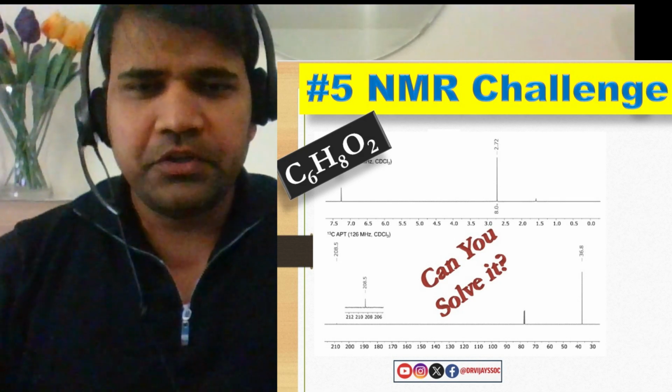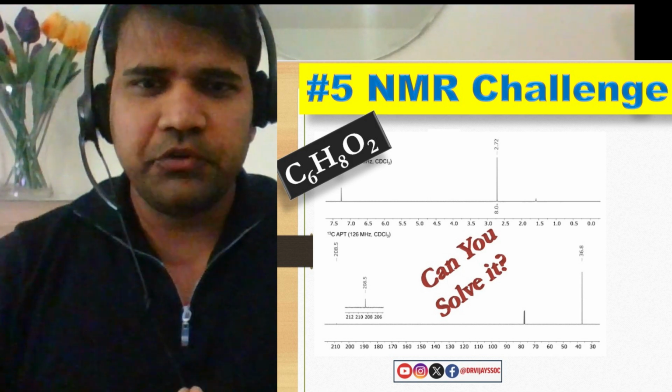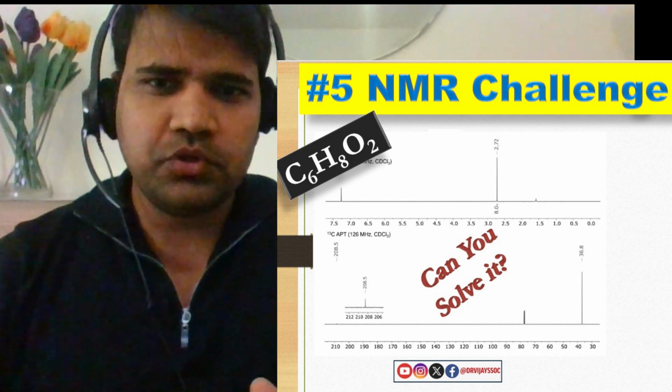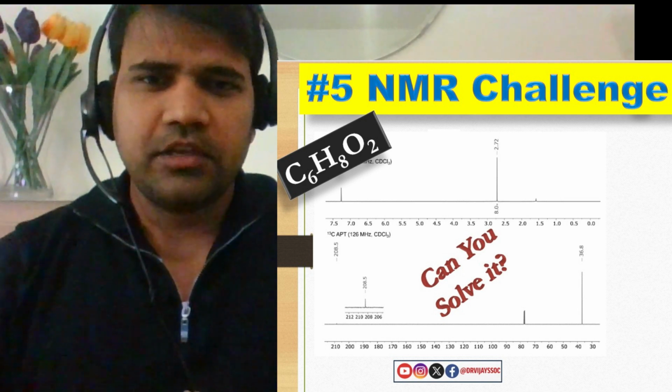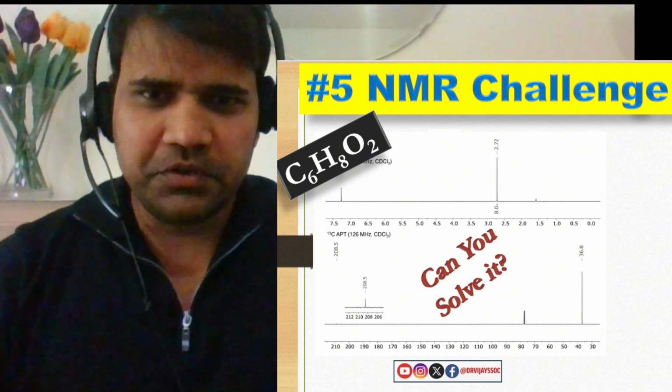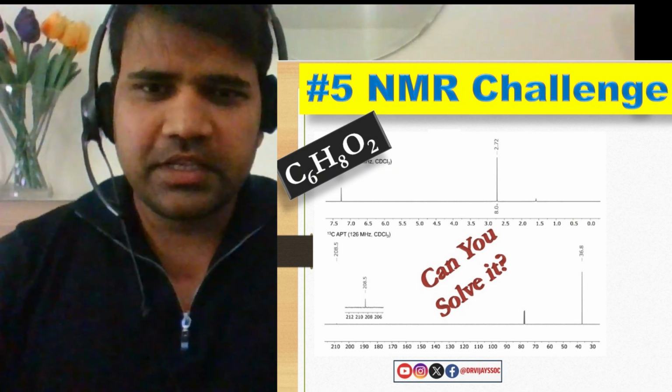In the previous video, I provided this NMR challenge for you, and today we are going to explain the solution step by step. If you have already solved it, then you can match your answer by the end of this video. So let's start today's NMR challenge.